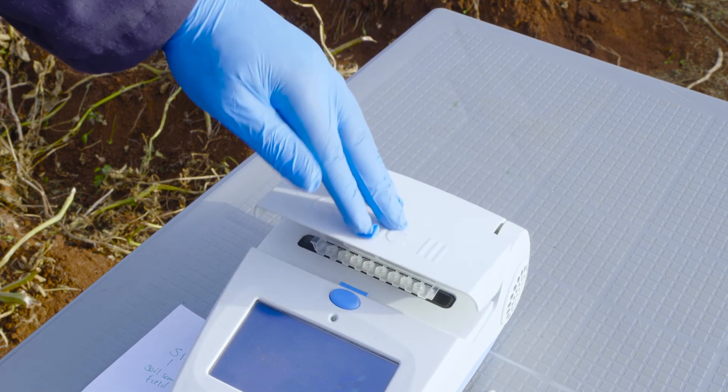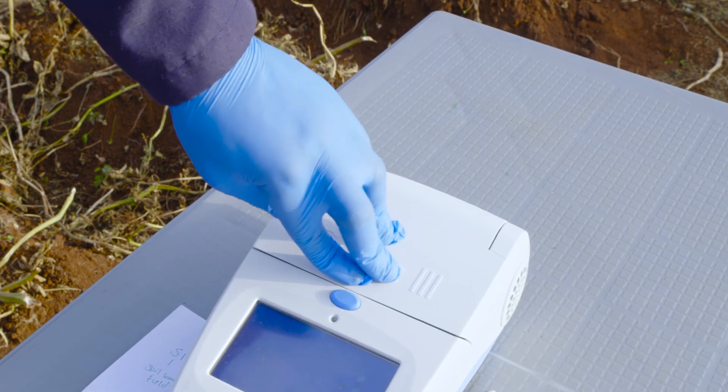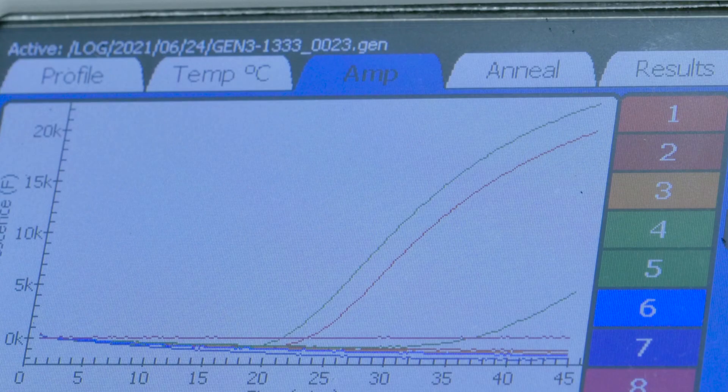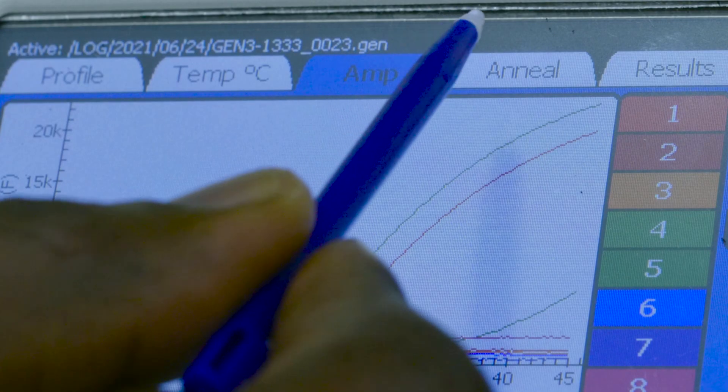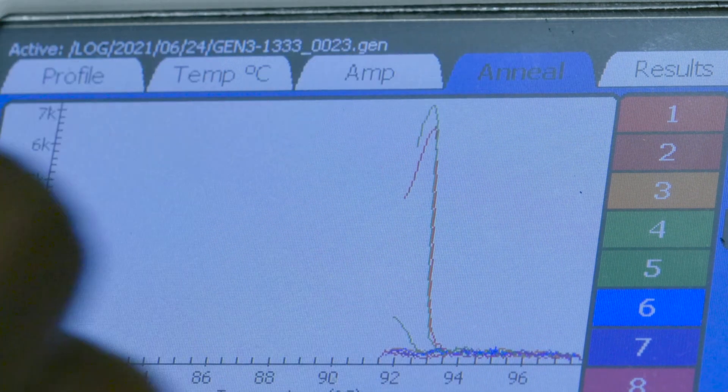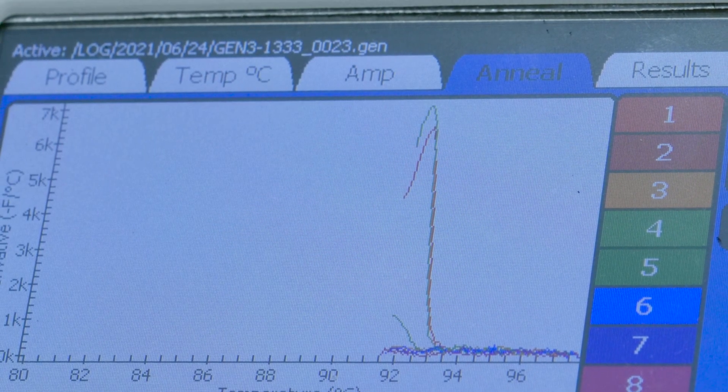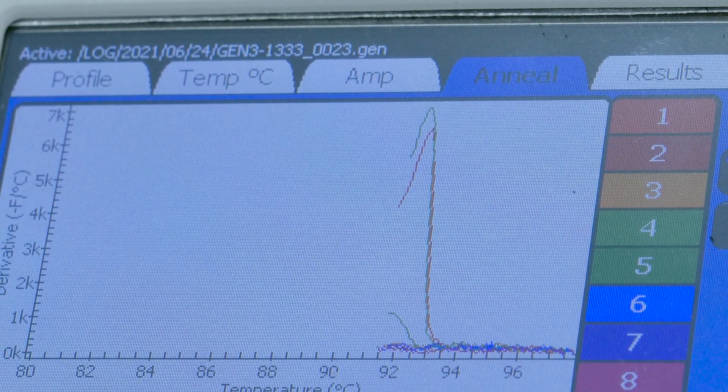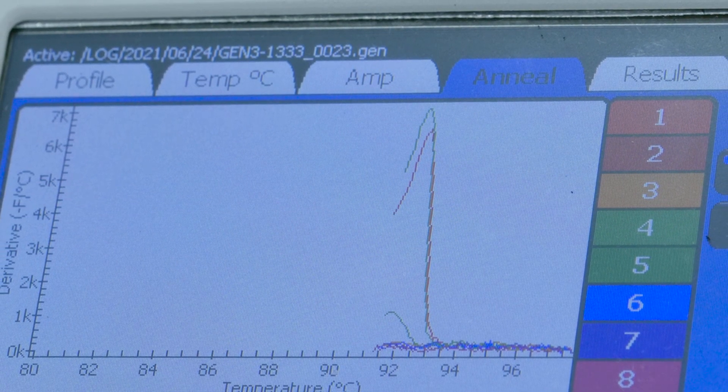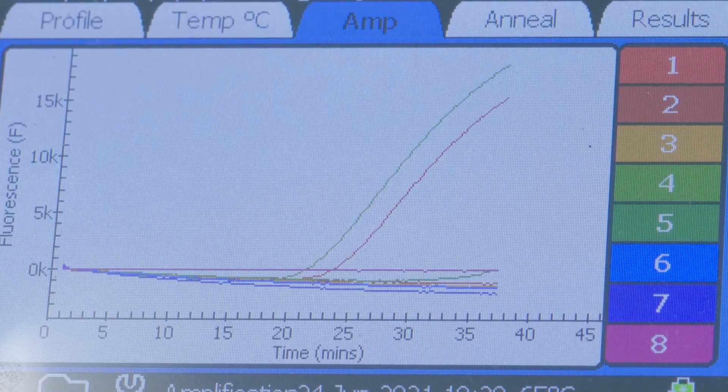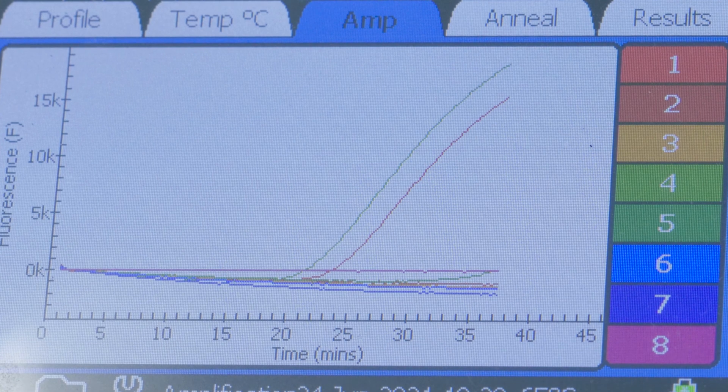If this doesn't happen, you might want to repeat the test and run a complementary test as this could be an indication that something else might have been amplified. If there is an amplification at any time while the anneal derivative is at the right temperature, this test should be considered positive. The time to positivity may indicate the concentration of the bacteria. The faster the amplification, the more bacteria present.